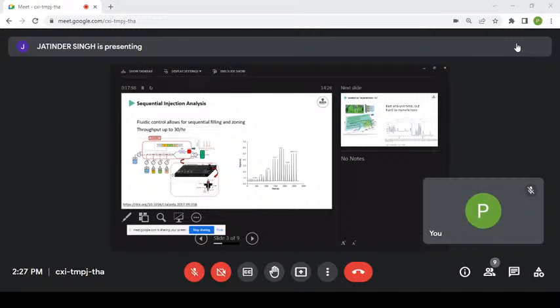So this is the sequence that we want to have. We start off filling the channel with a little bit of carrier. It comes from here. So all of these valves here are closed. Open that one, carrier gets in front of the train. Then we open our next valve, which is reagent number 2, sitting here.